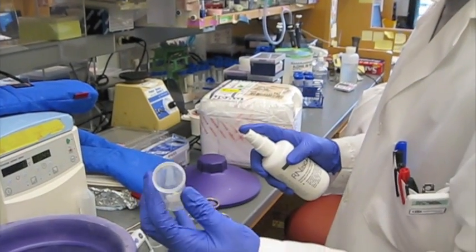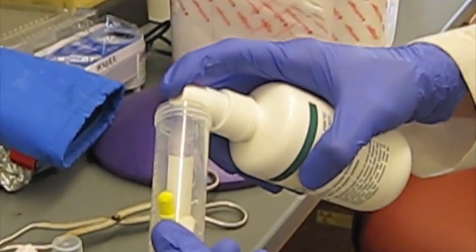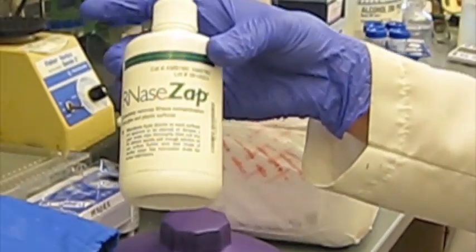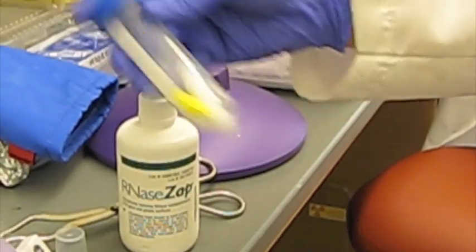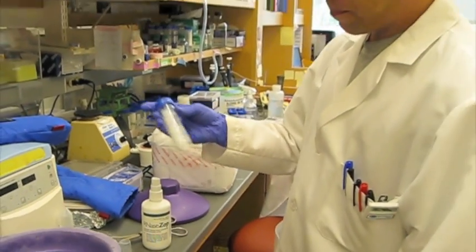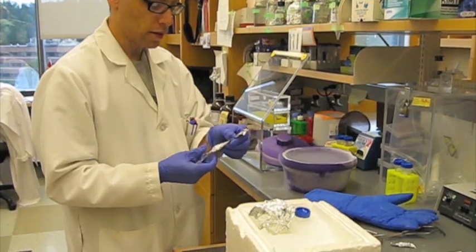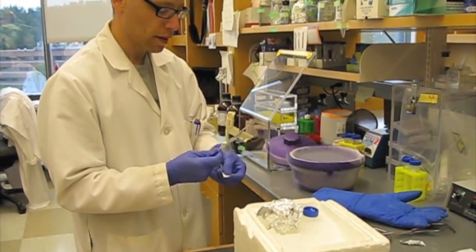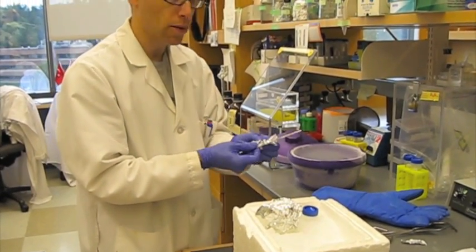We can also prepare our stir bars. We put them in a frothy milk container and just give them a couple of spritz of RNase Away, then shake it around. And the spatulas — we bake them to make them RNase-free. We do that at 250 degrees for a few hours.